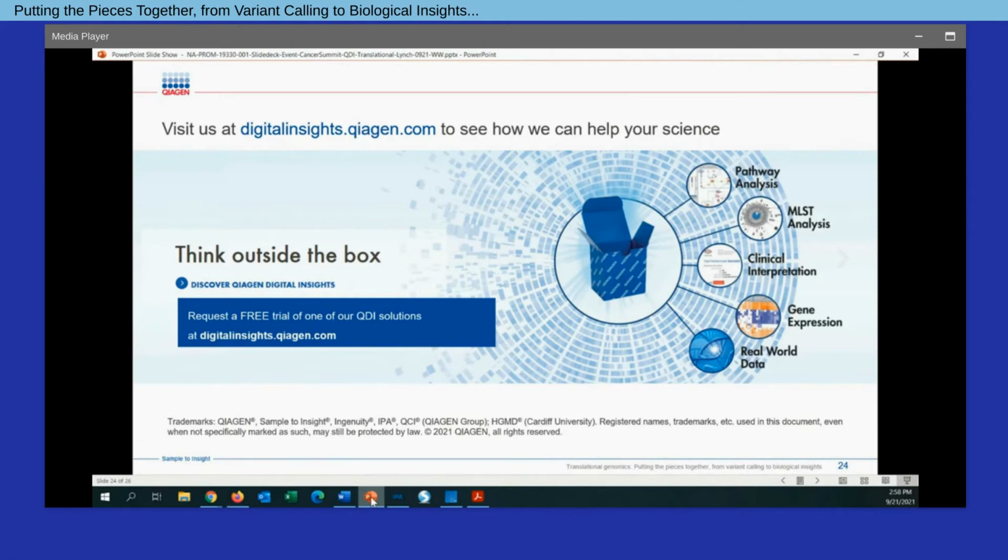Yeah. Okay, great. And then looks like maybe the last question. For heat maps, does Ingenuity have the ability to cluster according to different metrics, Euclidean, Manhattan, etc.? So currently the clustering, I didn't show that with the heat map that I showed. We do have clustering based on different criteria. I think there is one option, I can't recall off the top of my head, for hierarchical clustering. So it's just one of those metrics, I believe Euclidean by default.